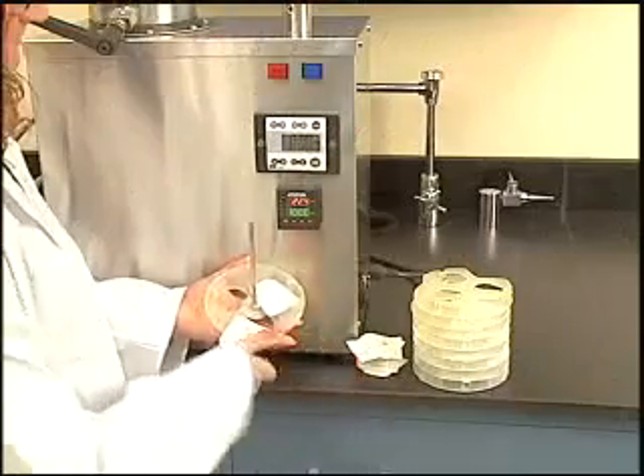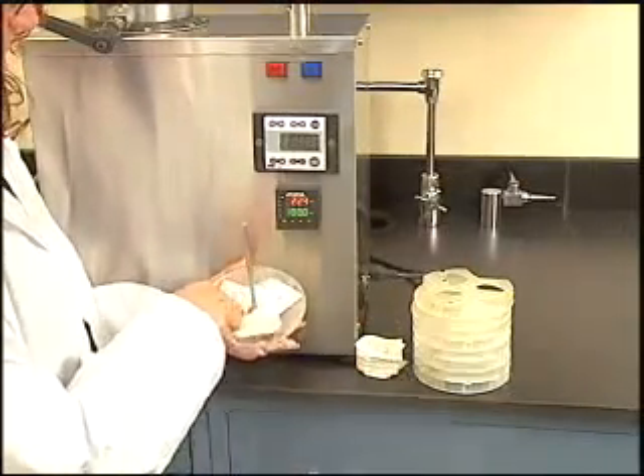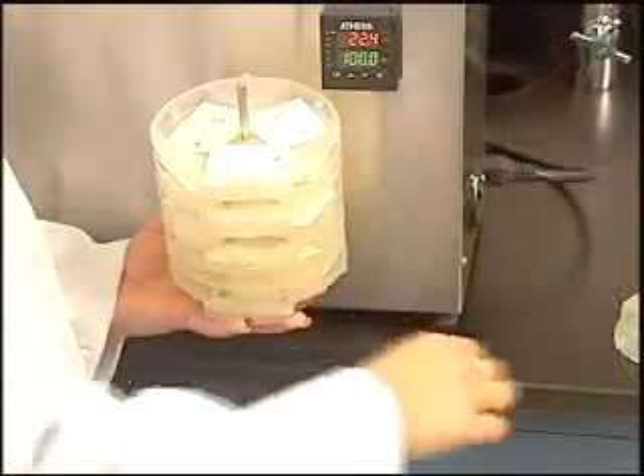After preparing up to 24 samples, the filter bag suspender trays are filled. Three samples are added to each level. After each of the eight trays are filled, a ninth tray is added as a top to secure the bags in place.